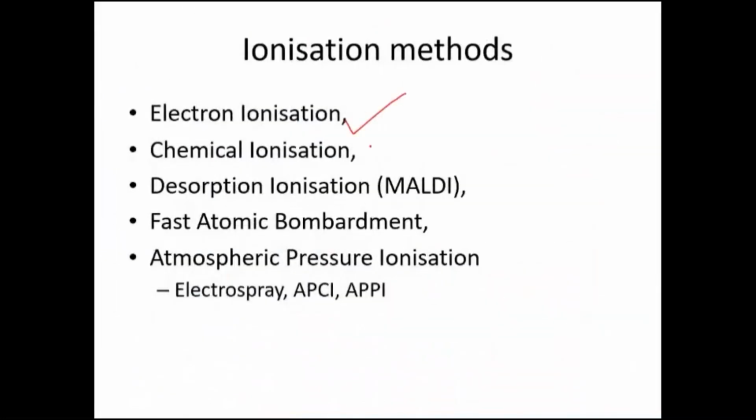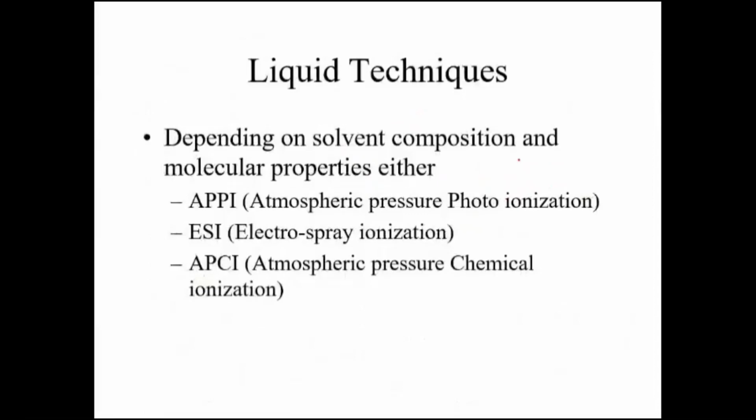Now, all these techniques, these two techniques, were carried out in what we have studied so far: electron ionization, chemical ionization. These two are remaining. They are related to matrix. Okay, both of them are related to matrix system. Let us start with liquid techniques, also atmospheric ionization techniques.